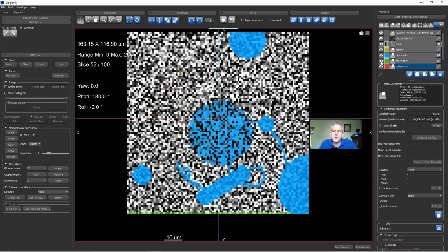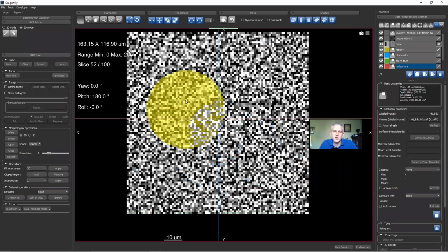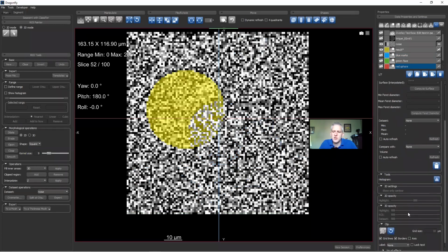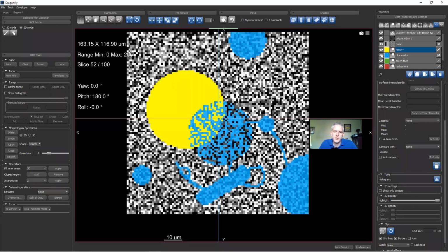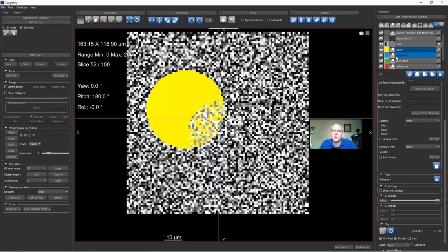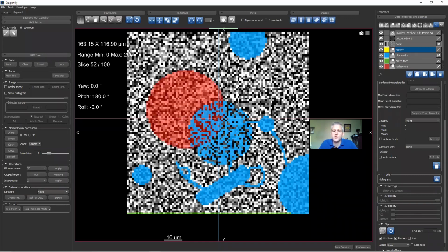And now if we look at A minus B, so it's all of these yellow pixels, I'm going to increase the 2D opacity. So I'm going to select result and then drag this highlight. You can see that all of these red pixels persisted, and all of the red pixels where there was no blue pixel persisted, but everywhere there was a blue, it got subtracted away. So that is a logical difference. That is the subtraction. So that's quite useful.